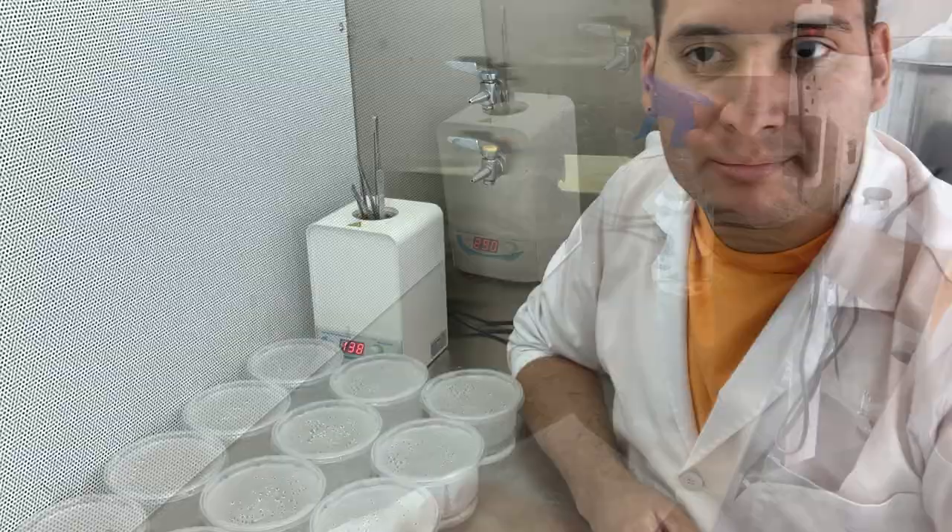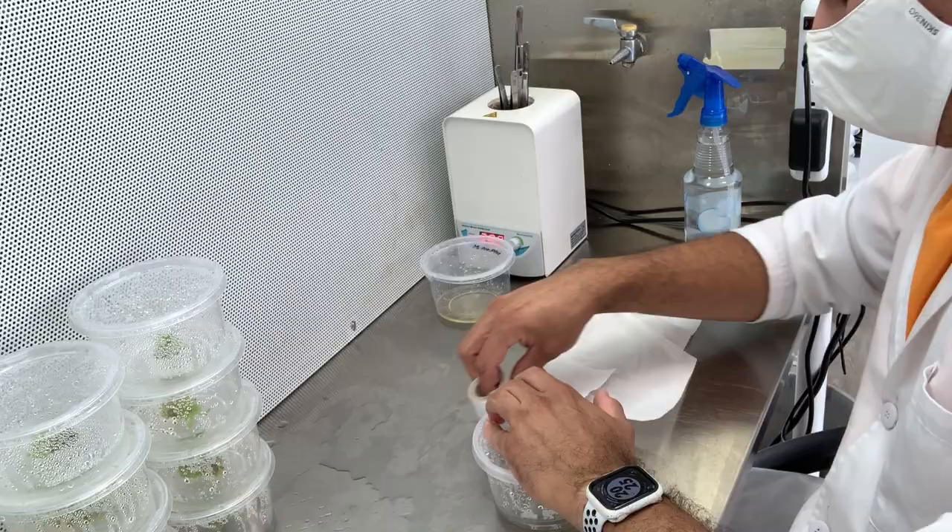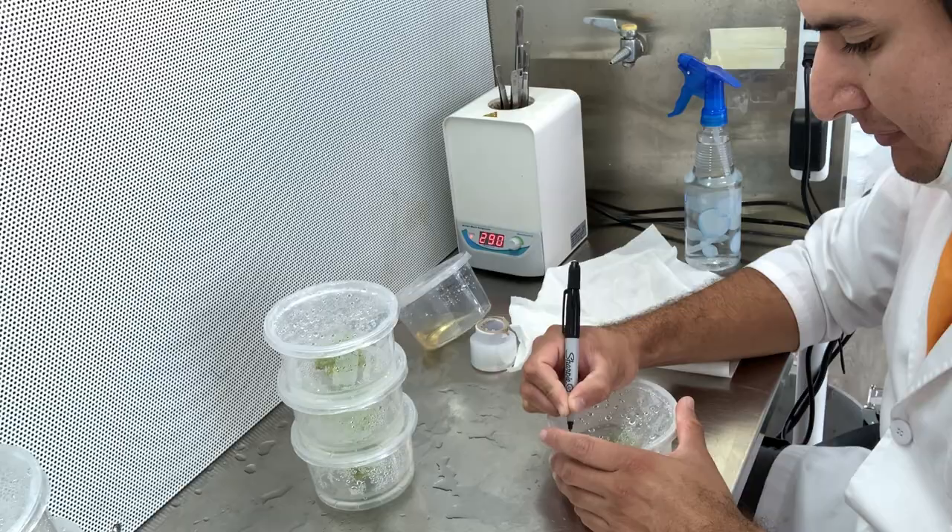What I do is take plants that I already have established in tissue culture. This is a Mexican Pinguicula that has been growing in this container for three months. From this one container, I make another 12, and this is a process that takes me between 15 and 20 minutes.